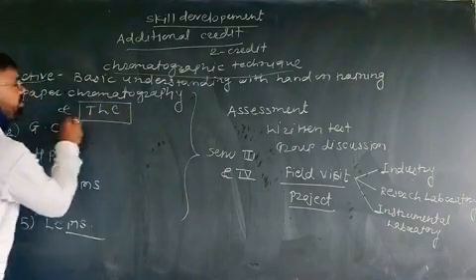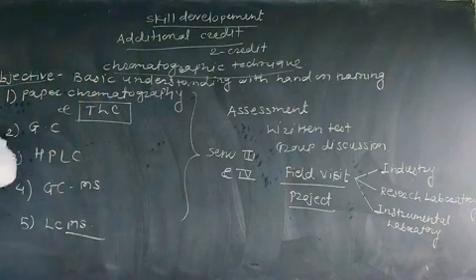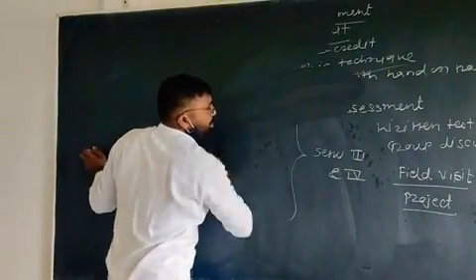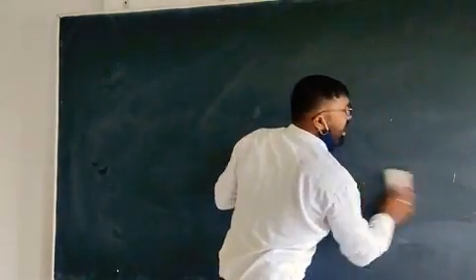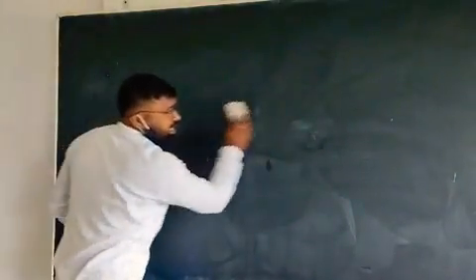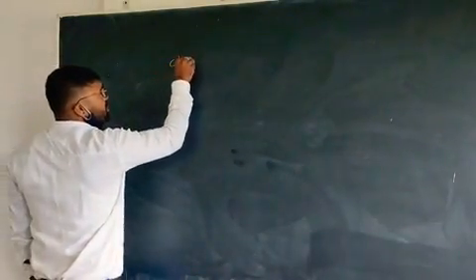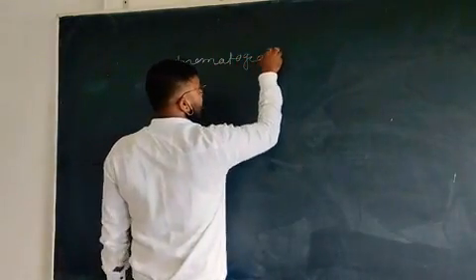In today's lecture, we would like to discuss thin layer chromatography. Actually, before starting the topic of thin layer chromatography, you should think about the basic concept of chromatography. No doubt, chromatography is studied by ourselves. Chromatography is used in a laboratory in SYBSc, TYBSc or FYBSc too. But before starting the actual topic, you should discuss chromatography.